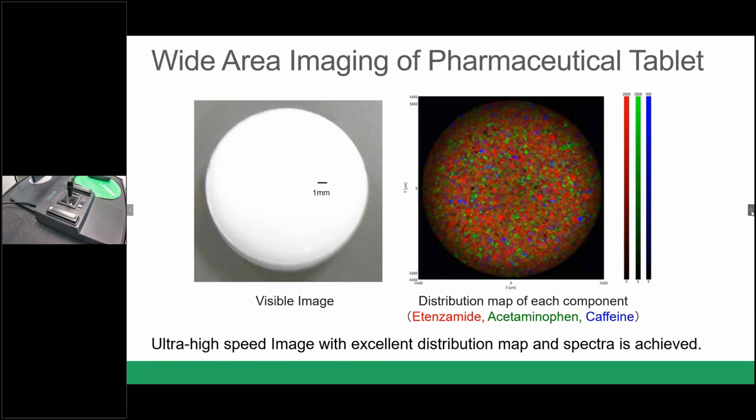With this image, also what I did, the QRI. QRI is also very effective for pharmaceutical tablets. This is a tablet of 10 millimeters in diameter, and this was done measuring like 30,000 different points. The image that I used for the polymeric beads was just something like 144. It took me something like 10 seconds.